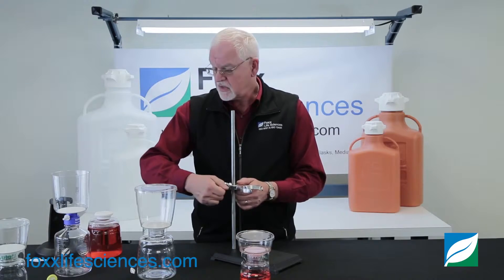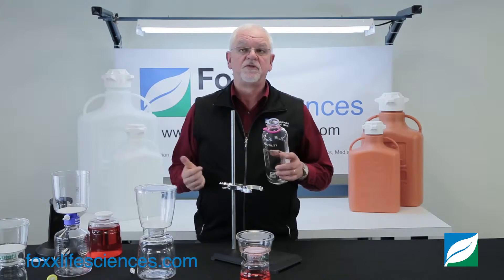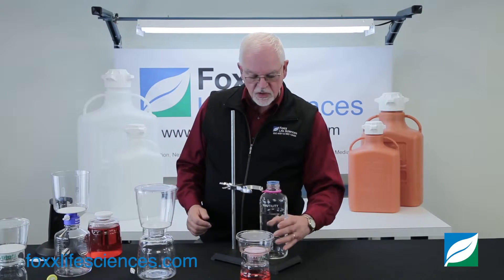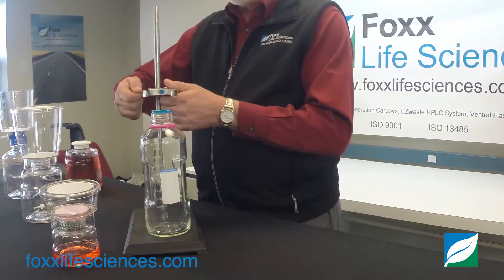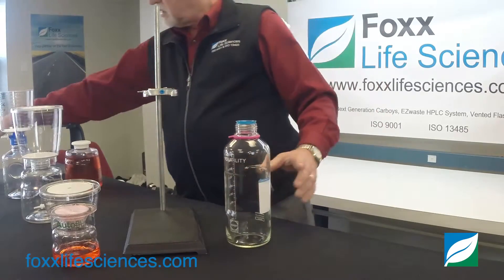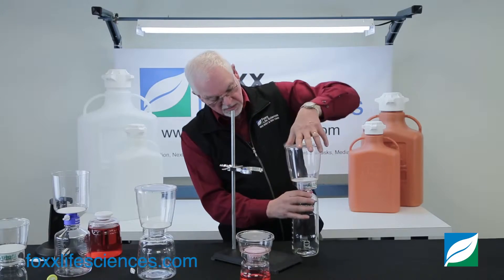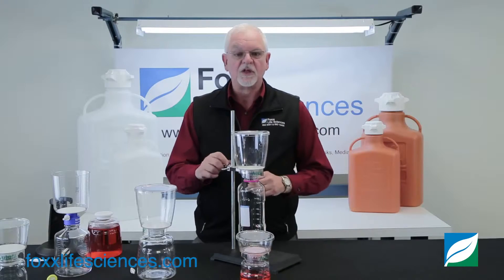What this does is it gives us the ability — if the customer would like to filter in a large glass bottle — we can set the height any way we want. So it's very easy for us to take the unit, screw it on, place it on the pedestal, and it's set and ready to go.